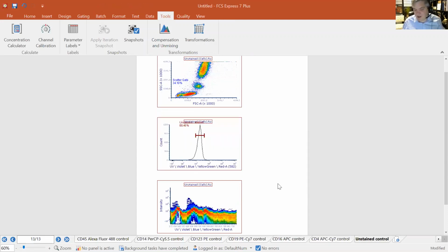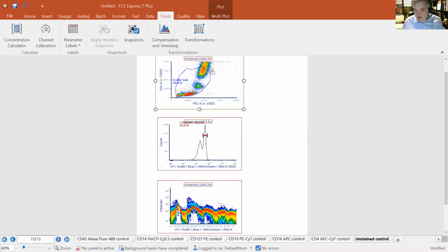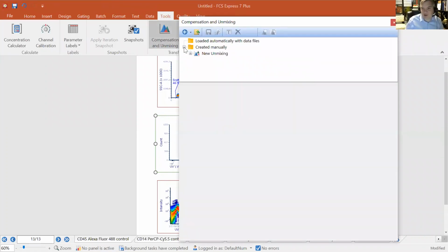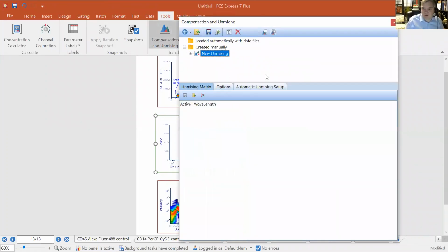And then finally, we'll get to our unstained control. For this particular data set, I like to make this a little bit bigger. We'll pick something that's our median between some of these different populations. And if we did have an autofluorescent control, of course we can include that. Again, we'll cover that in a more in-depth webinar later this month.